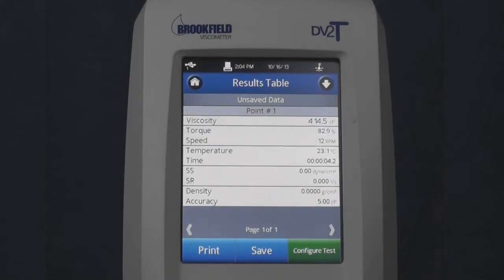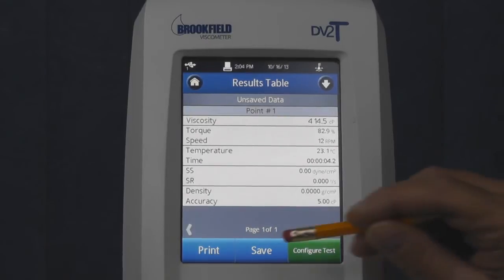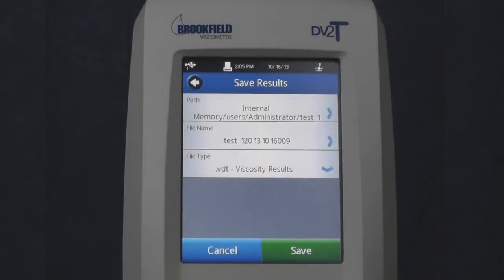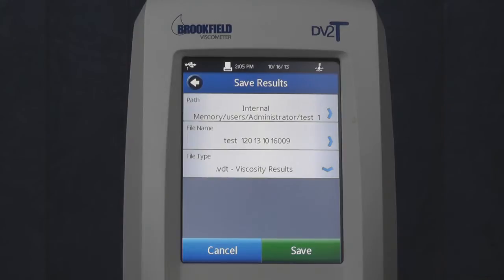At the conclusion of a test, the results screen will be displayed. To save the results, touch the Save button. The path will be populated with either the Save Results path selected in the test method or the default path set by the administrator.